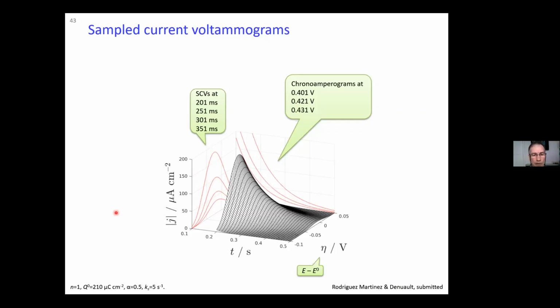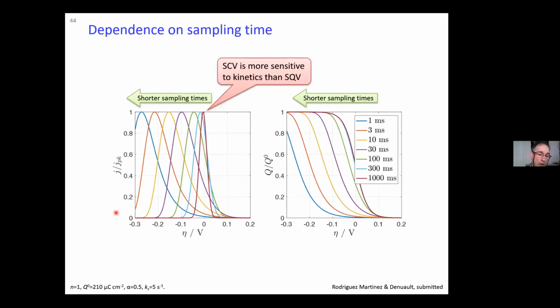These are sample current voltammograms, and we've done the same for the charge. So these are sample voltacoulograms as a function of the target potential.